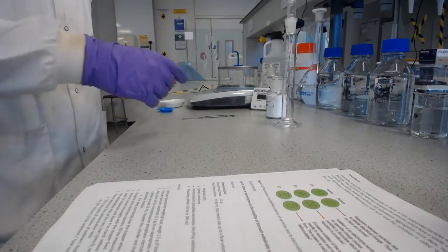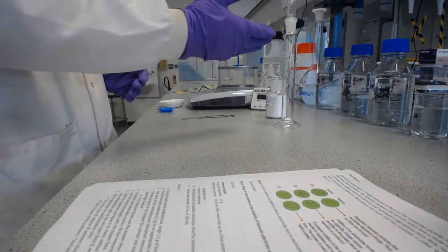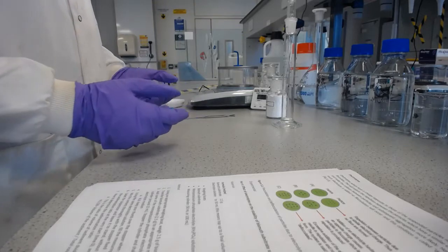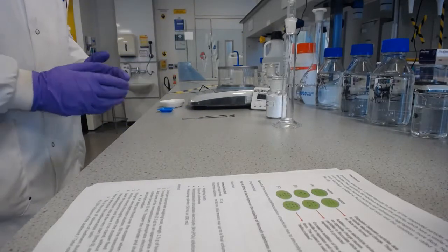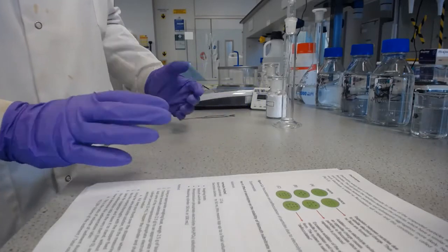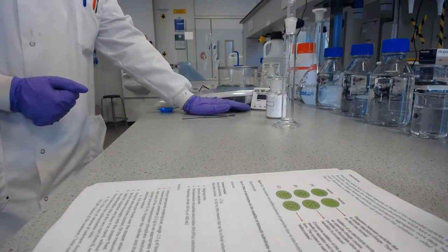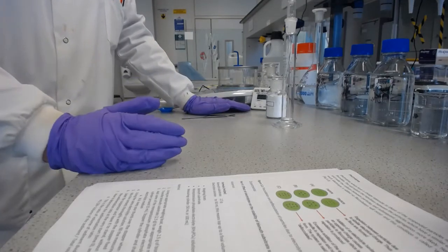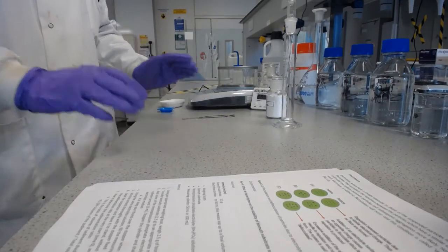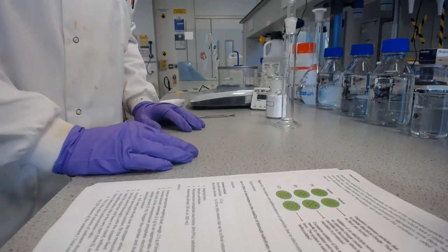But we'll make an admixture first, where we put a small amount in, make a nice smooth mixture, fill it up to 50 millilitres, mix it, stopper them, and then what we're going to do is put all 5 of those suspensions next to each other, and then set a timer off. And then at set intervals, we're going to record the sedimentation ratio that is occurring in that suspension.